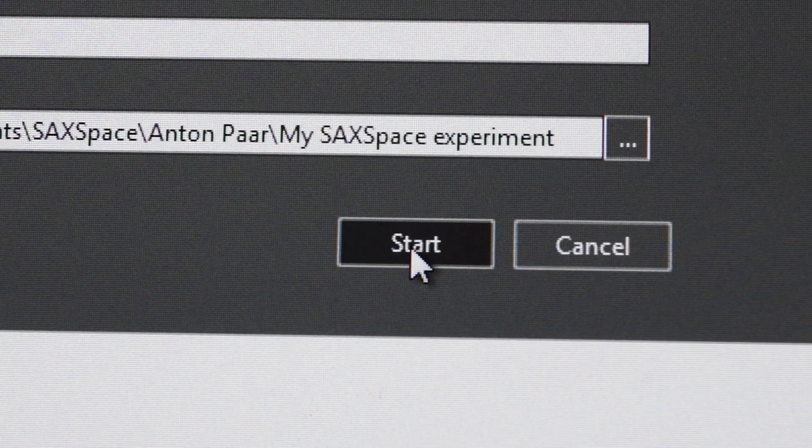This is the fastest way to reliable SACS results and frankly, the most relaxing one.